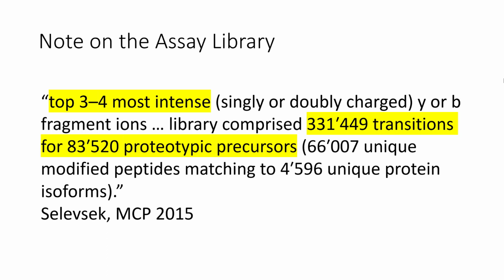So it's definitely a very valuable paper, but as with most things, the first thing that gets done turns out not to be perfect. We don't use the old SWATH method anymore. The instruments are getting better. But still, good to be aware of. Especially if you're going back to old data and deciding, well, can I just use this method? My answer was no. Part of it also was they said, we chose the 3 to 4 most intense ions, and that's what they use. That's their assay library.